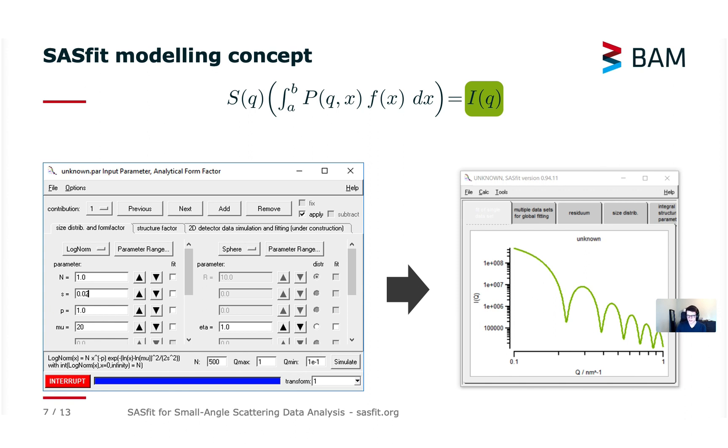Here again we have the building blocks of the scattering formula. The form factor is highlighted in red, corresponds to the right side of this parameter window and there's a size distribution here highlighted in orange which is on the left side of the parameter window and on another tab you can add and configure a structure factor.